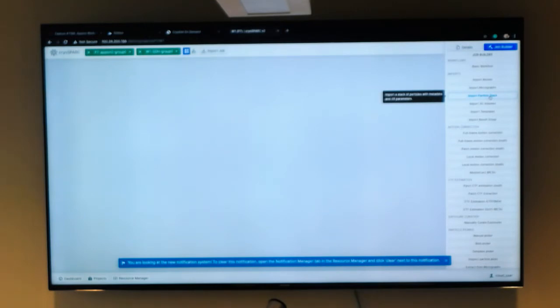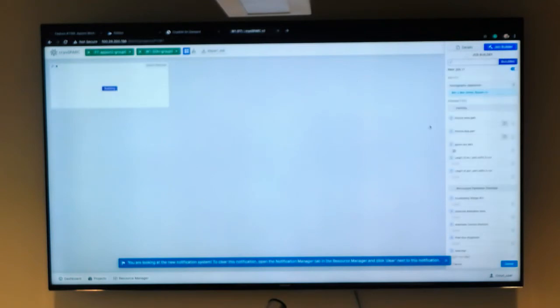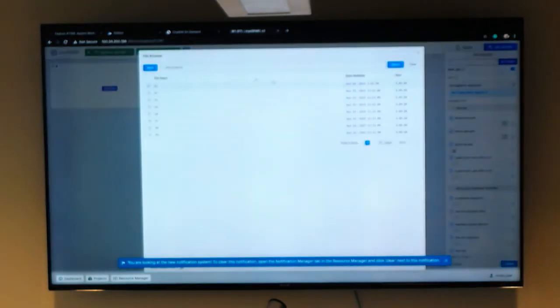So now this is good because you can get some comparison of the different outputs of running very similar jobs. In this case, we're going to import a particle stack, and the particle stack we're going to go to is in this particular location. In this case, the GDH bin 2 would be the 144 pixel clip.